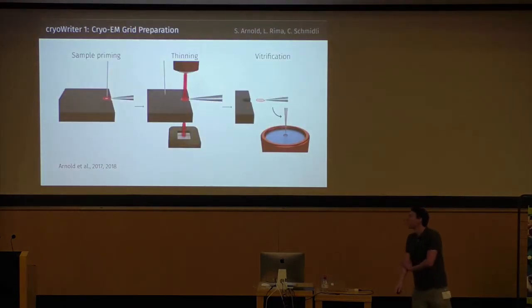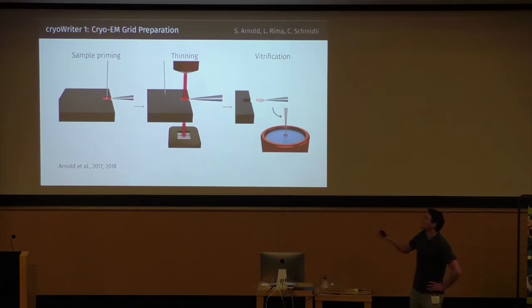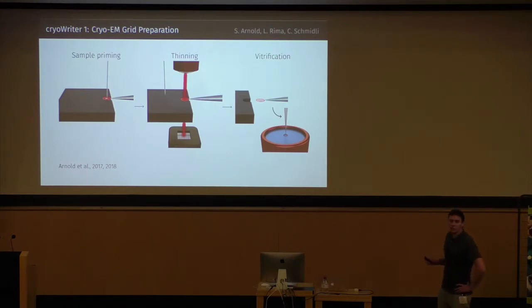Now to the cryo part. This one also involves three steps. The first step is the sample priming, where the sample is written on the grid in a spiral pattern, and in the end all the excess sample is removed. This grid is temperature controlled by this dew point stage, where it is always in contact. This is followed by a very short thinning step which can be monitored by laser absorption, and then it's rapidly plunge frozen in liquid ethane for vitrification.